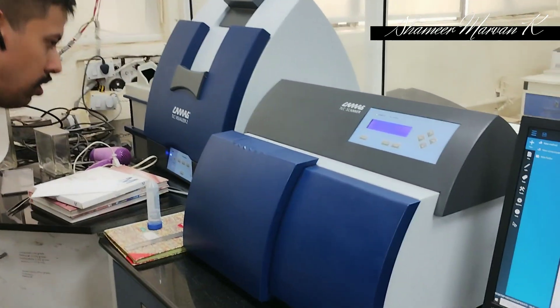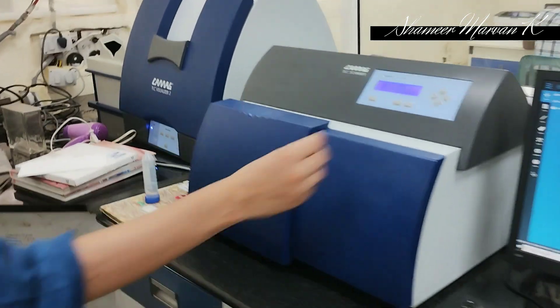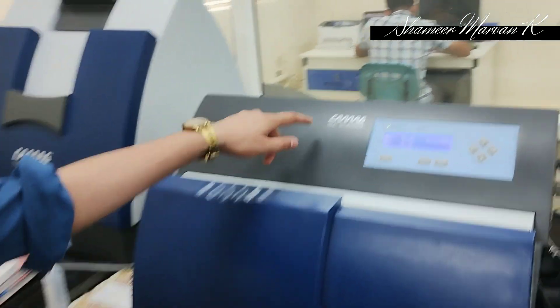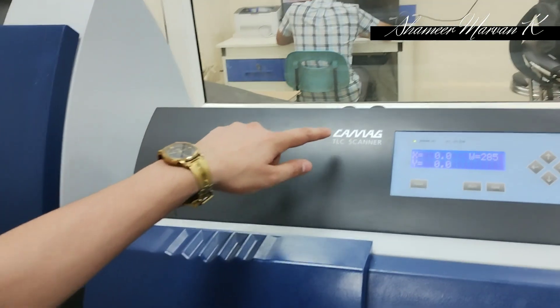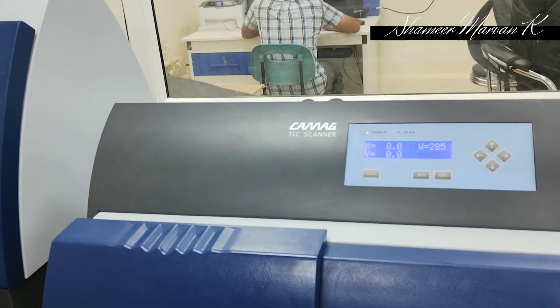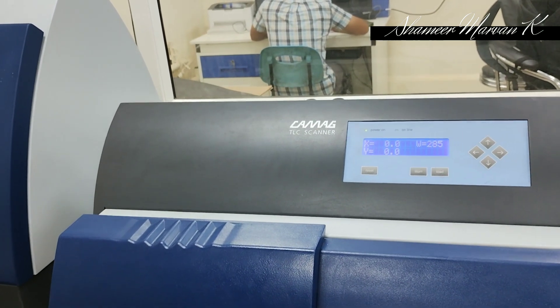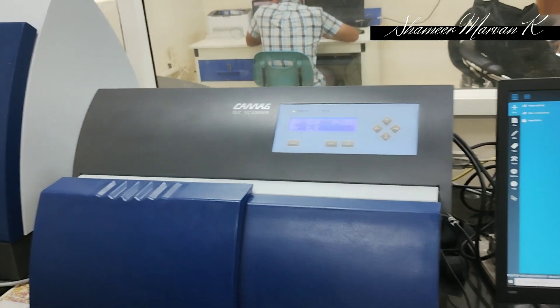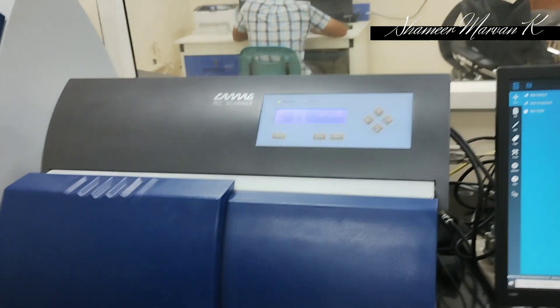With this brief introduction, I will start the demo. The high performance thin layer chromatography instrument is manufactured by CAMAG. The name is shown here. CAMAG is a worldwide manufacturer of HPTLC instruments and its spare parts.